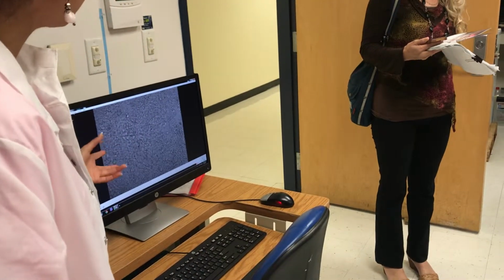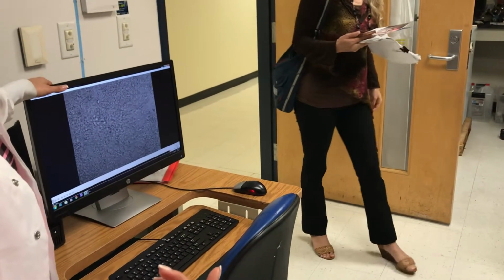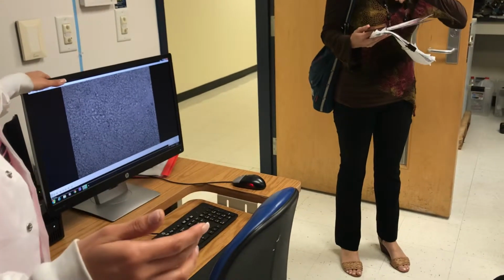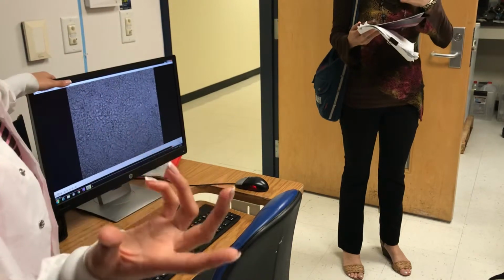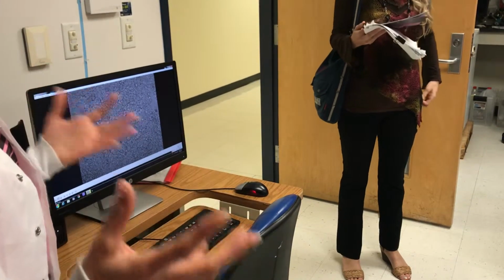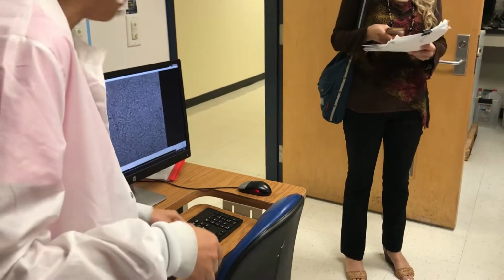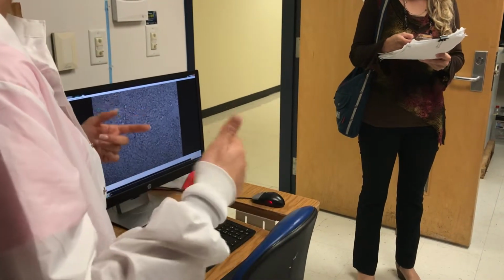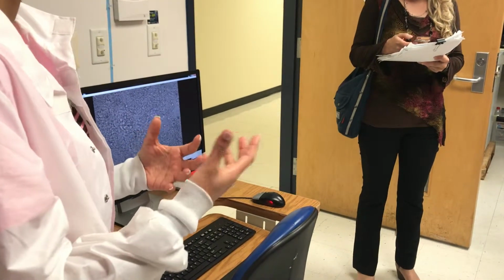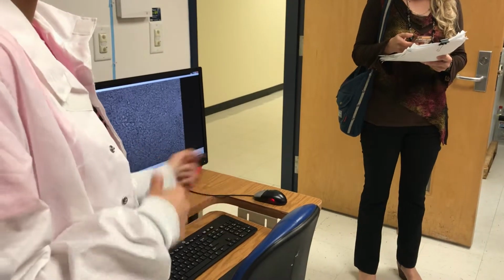So let's say this is beating. How much is a human heartbeat per minute? What is it, average? 60. 60 is really good for someone who's like an athlete. Technically, along all people, it's about 70, 75. So let's say that this is 75 beats per minute. Now I put a drug in those wells, and then I monitor the beating, and if it goes much faster, then that's gonna be a good drug for someone who has a very slow heart rate to increase it up and reverse. Do you see the reason why we're doing this?